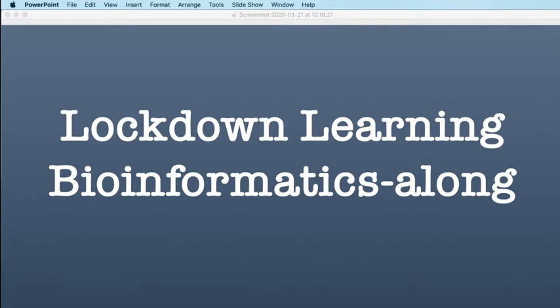using R, which is a programming language which is able to run in Linux as well as Windows and OS X, and is a statistical programming framework which we will use for data analysis. So we'll do a whole load of data processing using our Linux tools, and then we'll move on to using R to analyse that data that we've processed.